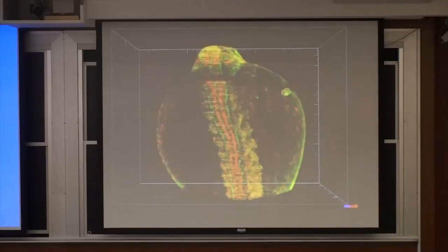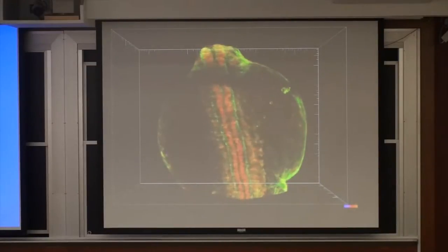So this is one of the movies where you can see this later part of the neurulation happens.